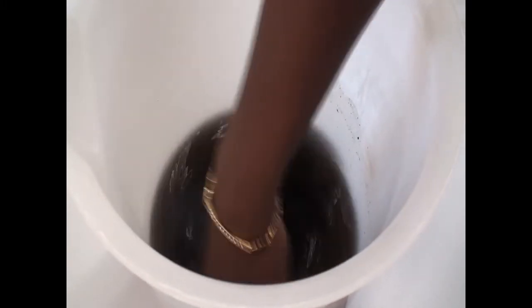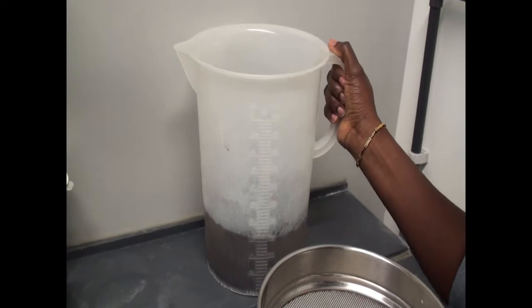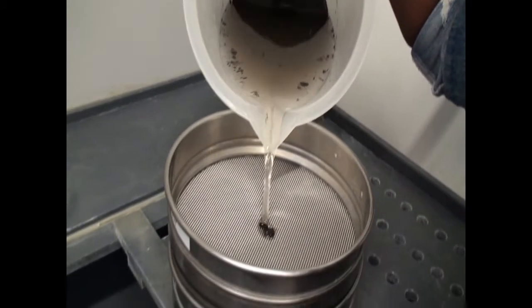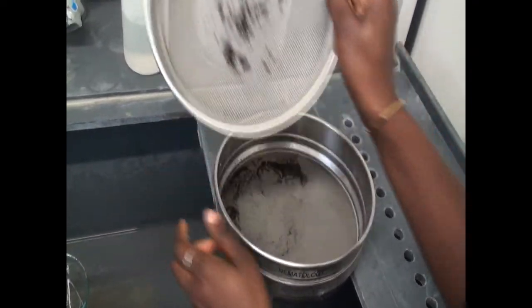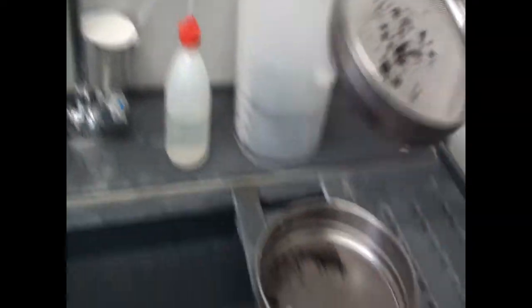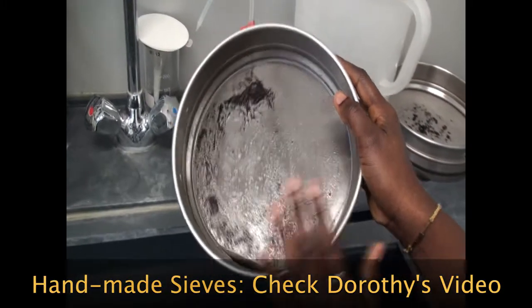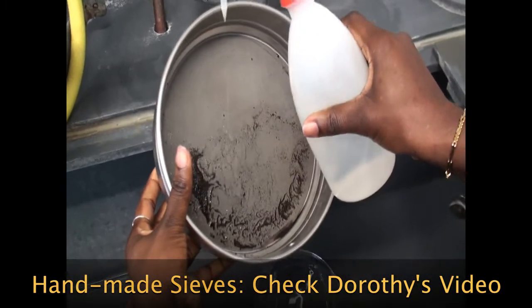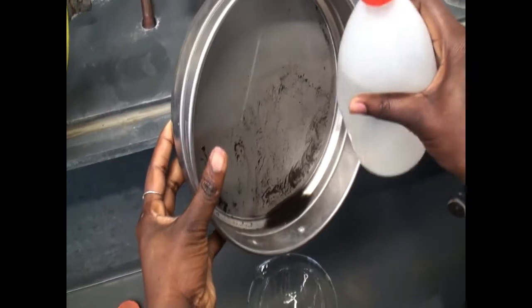At this point we shall allow the solution to settle for 60 seconds. After 60 seconds, we're going to carry the contents of the bucket and empty it into the sieves. The debris have been collected in the larger sieve, and the finer material is in the small sieve, which we're now going to wash out into a beaker.